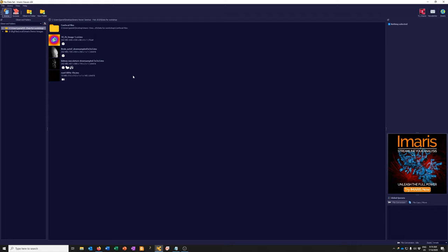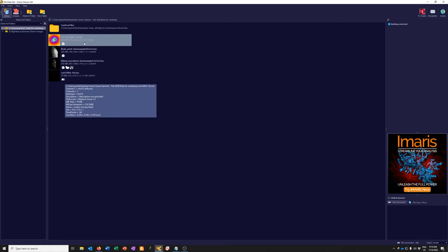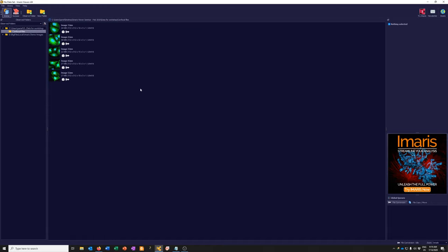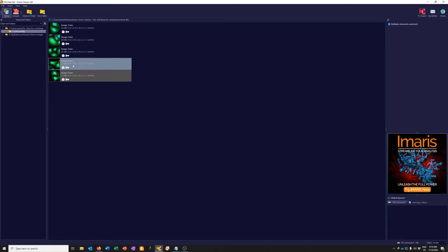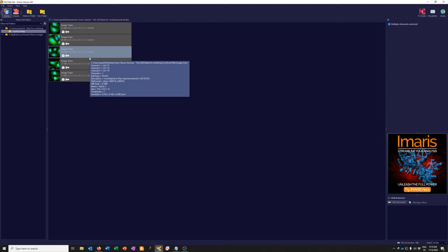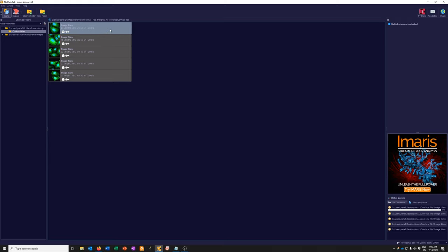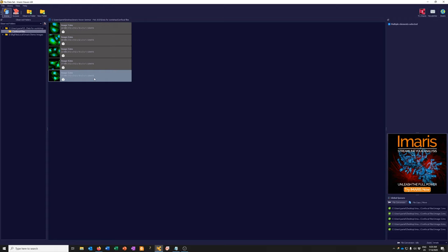Now you can see this folder has four different data sets. Some, like this one, are not 3D — it's a 2D time lapse. Two others are 3D, and one is 3D with additional elements. There's a subfolder called 'confocal files' with three-dimensional data sets that all need to be converted — these are .LSM files from a Zeiss confocal. To convert them, I'll select all of them with shift-click, right-click, and choose 'Convert to native Imaris file format.' The progress shows at the bottom — it's very fast because these are small files.